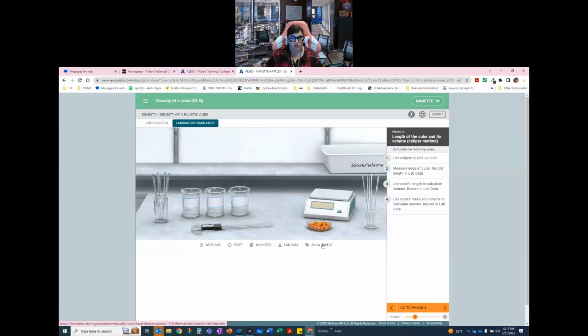Just keep trying to click around because it may be that you're trying to pick up something that's here and it thinks you need to be over here. I don't understand why it's like that, but it does. Again, density is something that we often need to deal with.